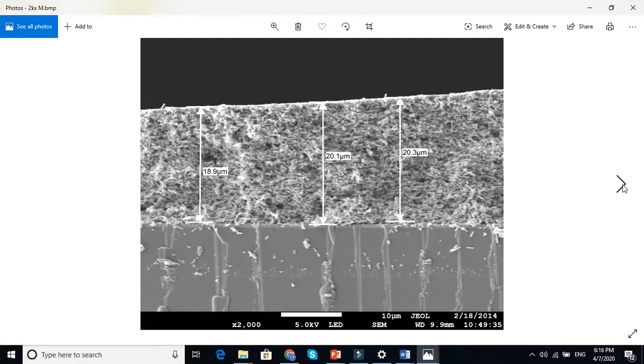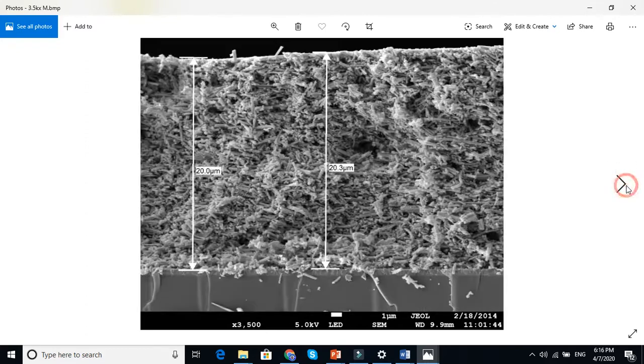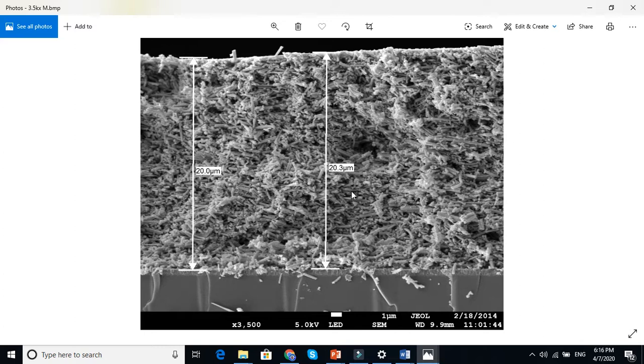Previously, if you look into the thickness of the layer using your naked eyes, you don't know whether the layer is uniform or not. But here you can clearly see that the layer is not uniform. And we further zoom here. Now you can see the fibers.